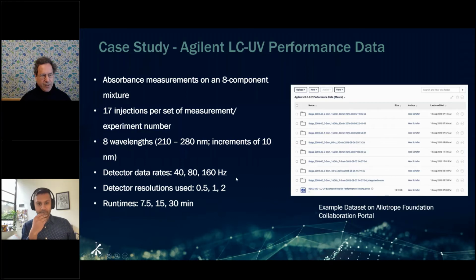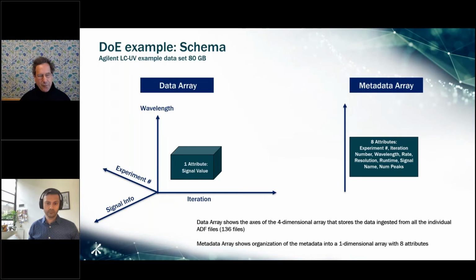There was variation in the detector data rates, detector resolution, and run times, which comprised an instrument DOE. And so Srikant will show that in a minute. I just wanted to further explain where Paradigm 4 is going, and in 2 slides, just to put that into context.